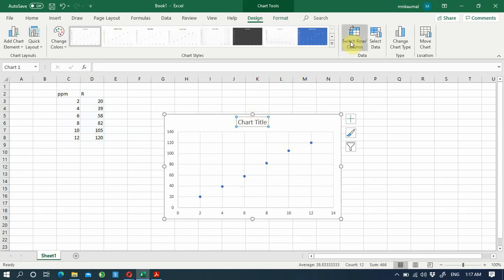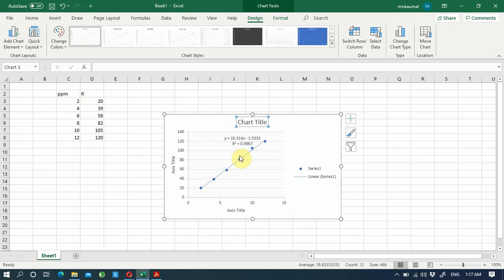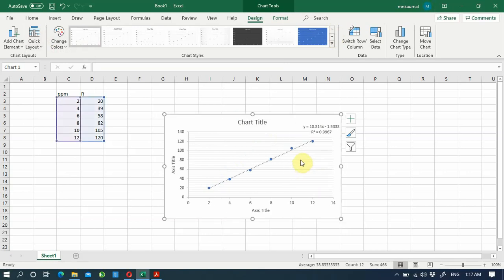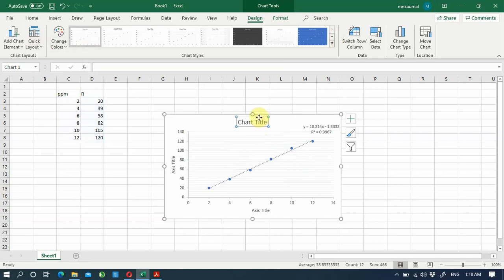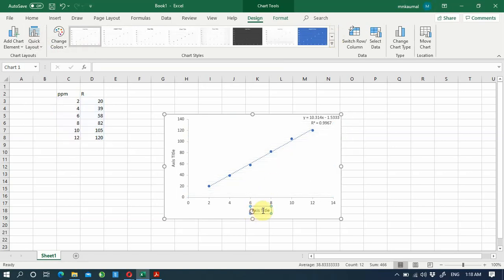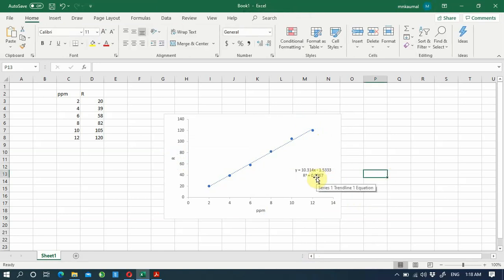I will remove the chart title, but before that I need some other options — specifically the slope and the correlation of this graph. The R-squared value is 0.9967. More than 0.99 is usually considered a good calibration graph.